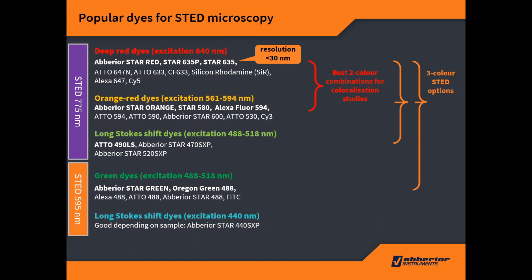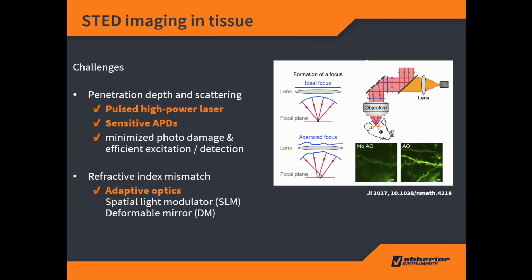When we're talking about samples, I just would like to mention quickly that nowadays there are lots of dyes you can use for STED microscopy, and if you're interested in this, you can have a look at our webpage or contact us.